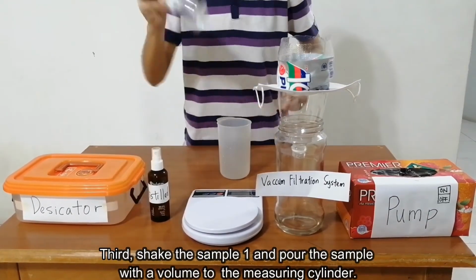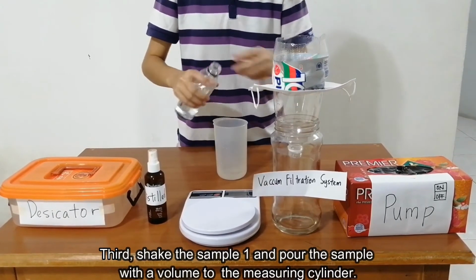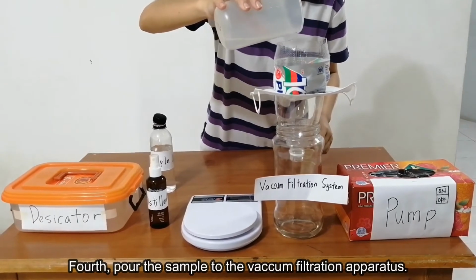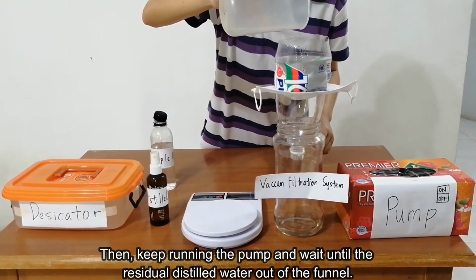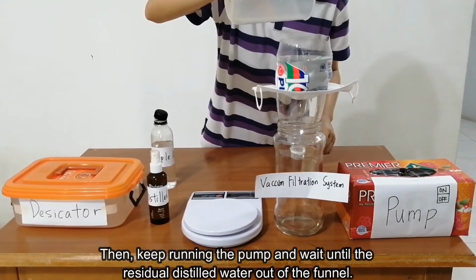Third, shake sample 1 and pour the sample with a set volume into the measuring cylinder. Pour the sample into the filtration apparatus. Then keep running the pump and wait until the residual distilled water is out of the funnel.